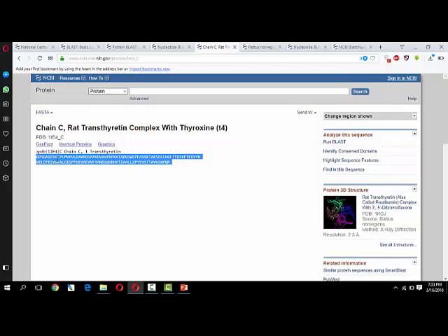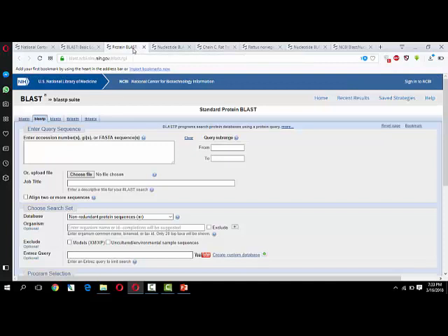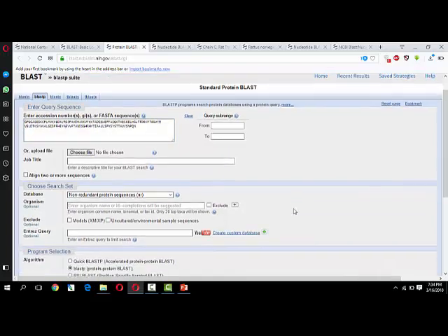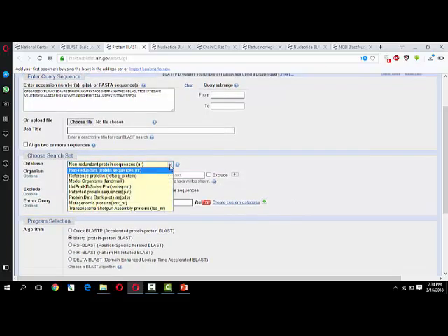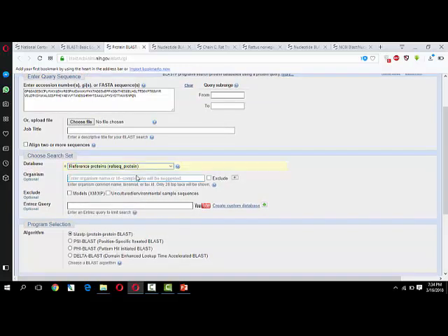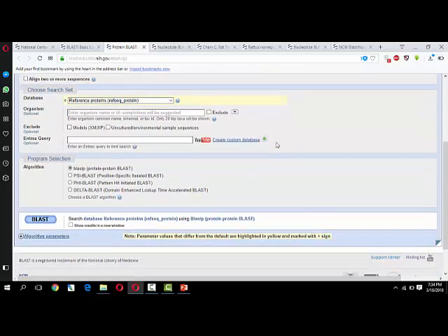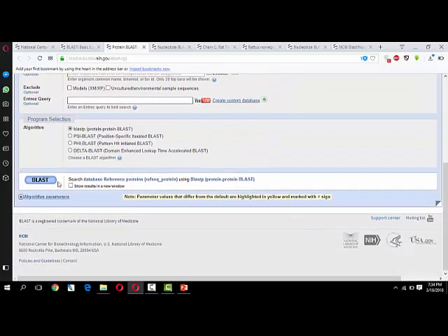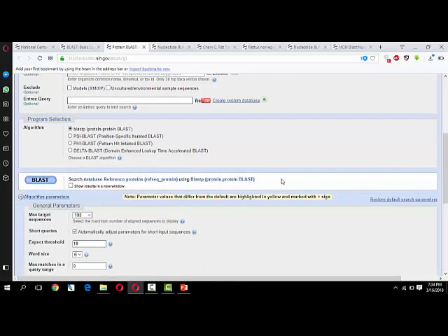Copy it. You can see G, P, G, G, A, G, E, S - these are the letters coded for different amino acids like M for methionine, G for glycine, and other single-letter codes for amino acids. Now you have opened protein BLAST. You can copy your FASTA format here. You can select any sort of database from here like reference protein sequences. I have selected reference sequence protein.